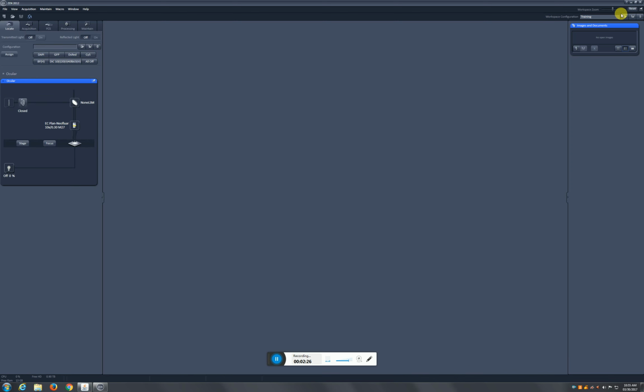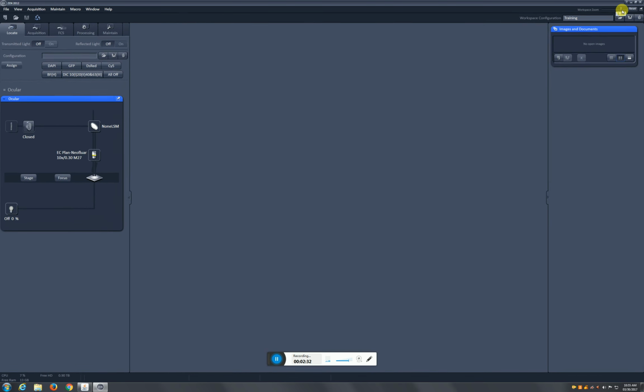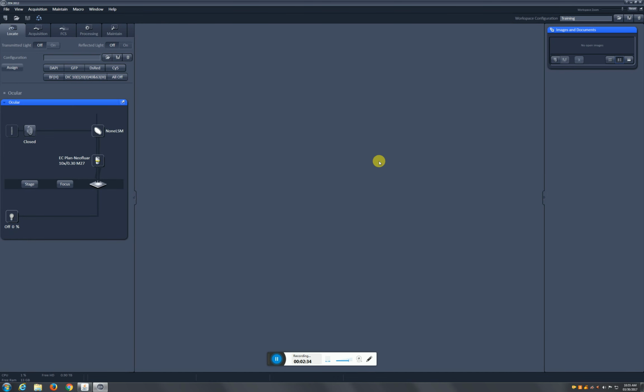Alright, and for the sake of this video, I'm going to increase the zoom factor just a little bit so everything can be a bit bigger and easier to see. And you can adjust that up here in the upper right corner of the program.